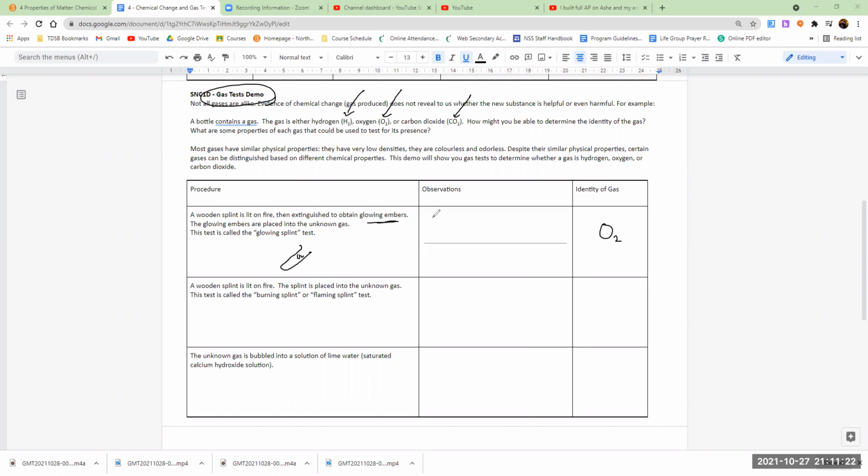This is what I did. I took some hydrogen peroxide that you can find at Shoppers Drug Mart, so 3%. And from here, I threw in some potassium iodide, which is a catalyst that allows the oxygen that's trapped inside here to run out. It just releases. So I have this bit of potassium iodide. I throw in the peroxide.